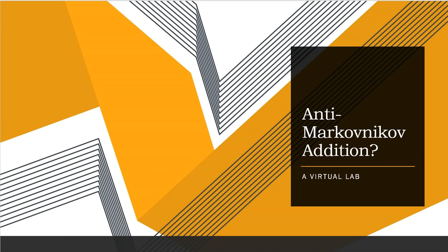So we talk about the Anti-Markovnikov in the classroom and in lecture because it makes us sound kind of fancy when we talk about it, don't it? Well, we're going to do a laboratory for Anti-Markovnikov for the same reason, I guess. It makes us feel fancy to say that we can do it.